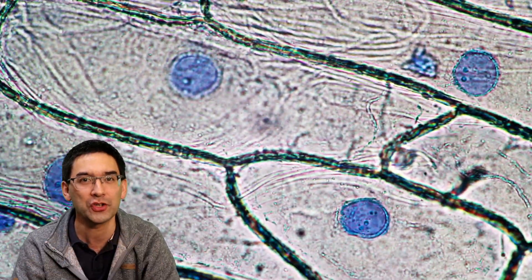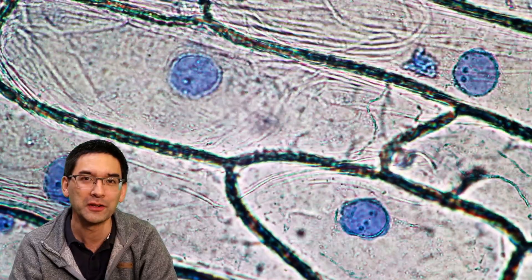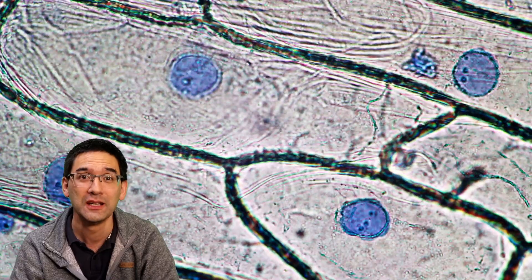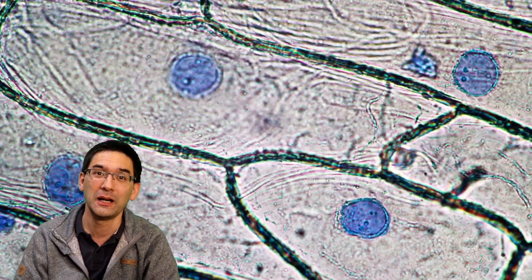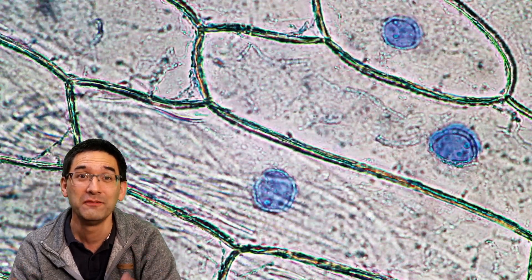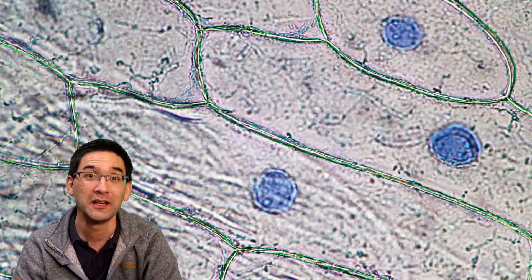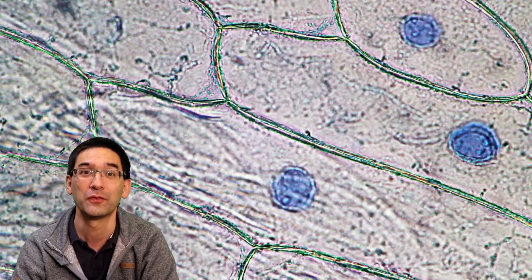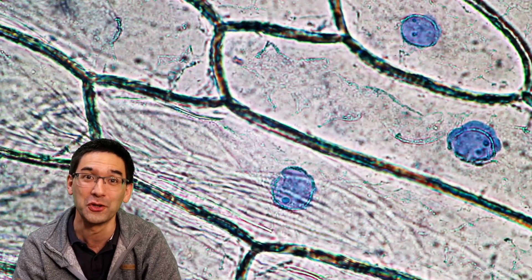That's the place where certain chemical reactions also happen. I like that the cells were so regularly stained — almost all of the cells, the nuclei of almost all of the cells, actually accepted the color. So in that sense it's quite reproducible, this procedure. It's a very simple lab practical that you can also do in introductory microscopy courses with students, because the chemical used is ink — it's pretty safe to use, also for children.